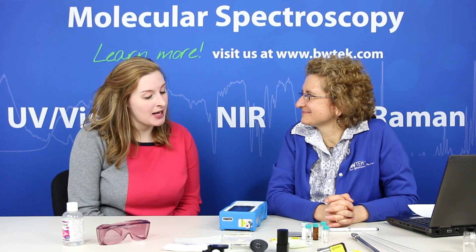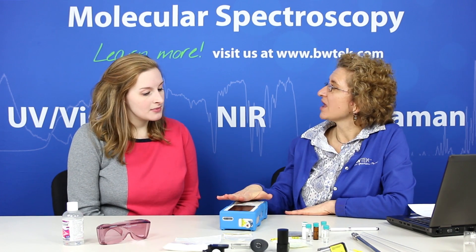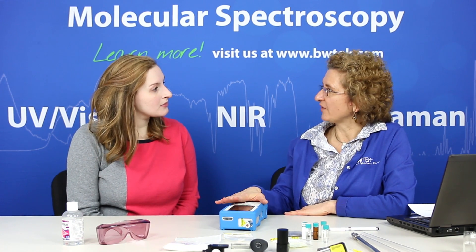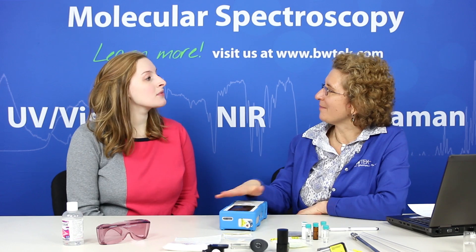Catherine, can you talk a little bit about the benefits of handheld Raman spectroscopy and some of the solutions that it's providing as well? Raman spectroscopy is a form of molecular spectroscopy and it gives us a fingerprint — a chemical fingerprint of samples that we measure. So we can use it to uniquely identify materials based on that signature. In the handheld, we have libraries or methods that we've developed that we compare what we're measuring to, so we get that rapid response of a pass/fail or a match for an unknown sample.